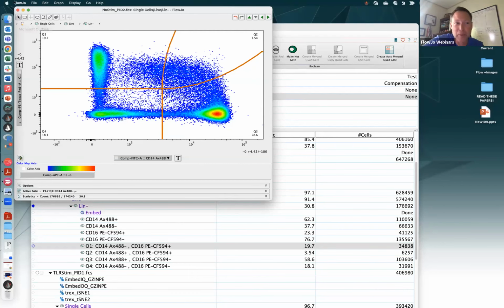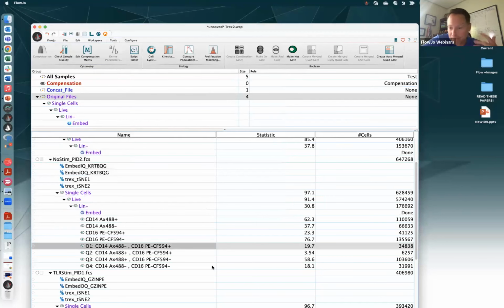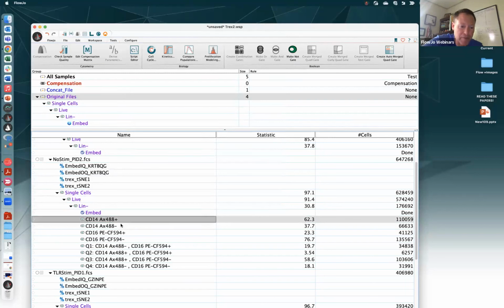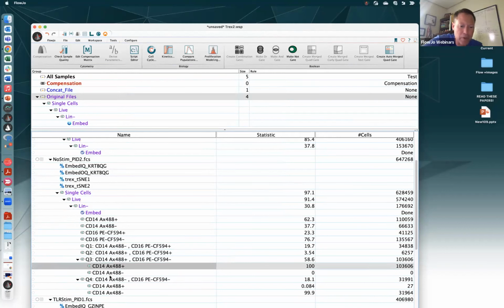And I think I will just point out, while I'm hoping for assistance there, that if you've got different similar branches at different places of a hierarchy, we'll just drop a couple of gates on different places. This is the spot where I wanted to do a particular selection.